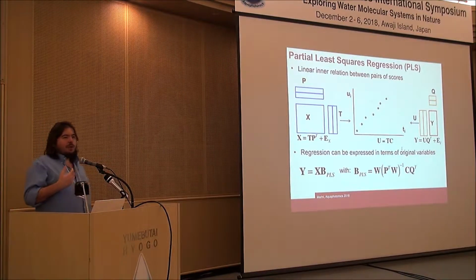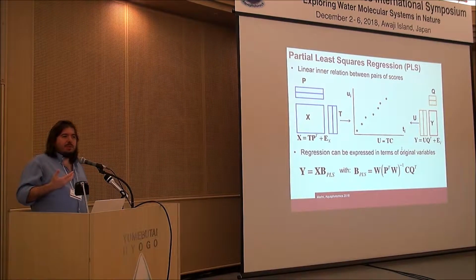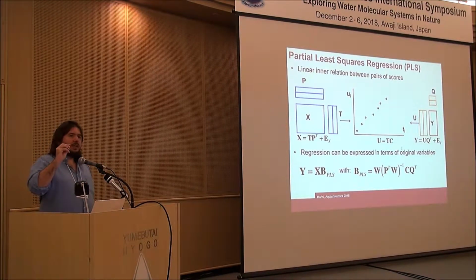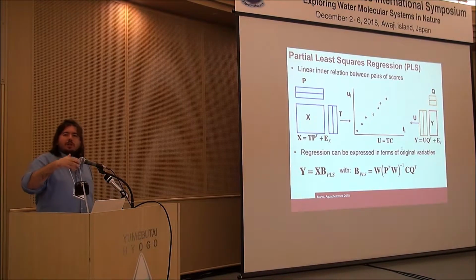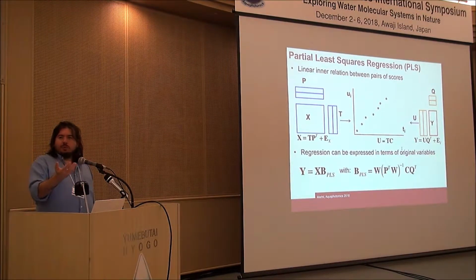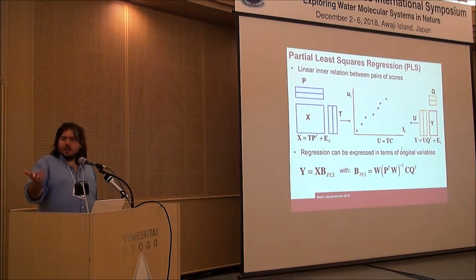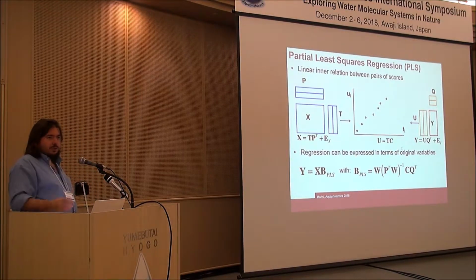Now, for newcomers or for people who are not very familiar with PLS, and also for thinking about what can be of interest for this community, on which kind of loading or profile to use to build aquagrams on, or to define water coordinates from.